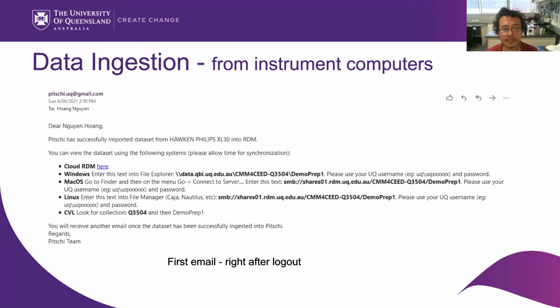So this is the template for the first email. Basically, it says that the raw data has been successfully imported from the instrument name. So this is one instrument in CMM. And here's how you access the data. You can access it using the Cloud RDM, which is a Nextcloud web interface. And then you can also look at the data from the desktops, and obviously with CVL as well.